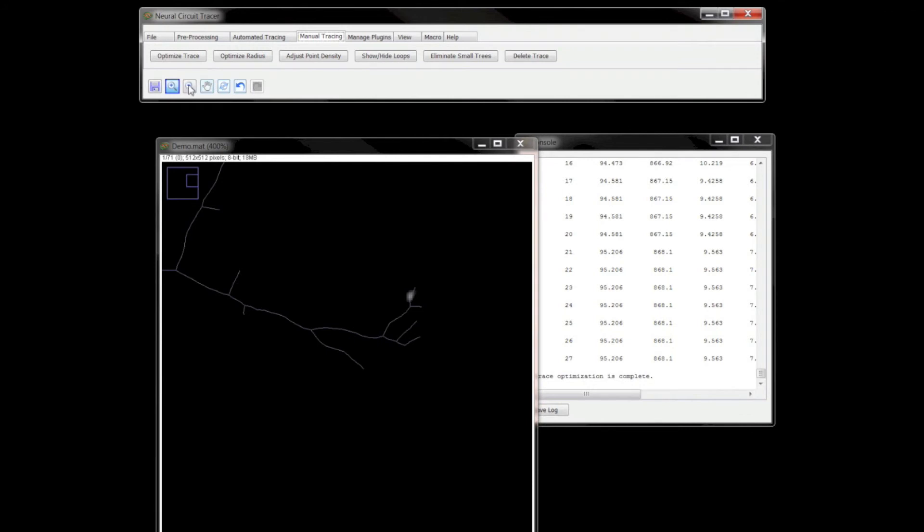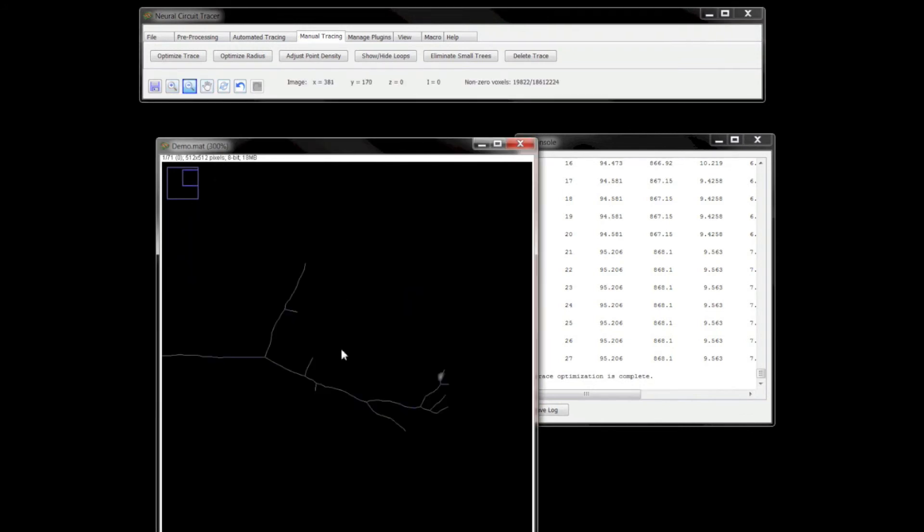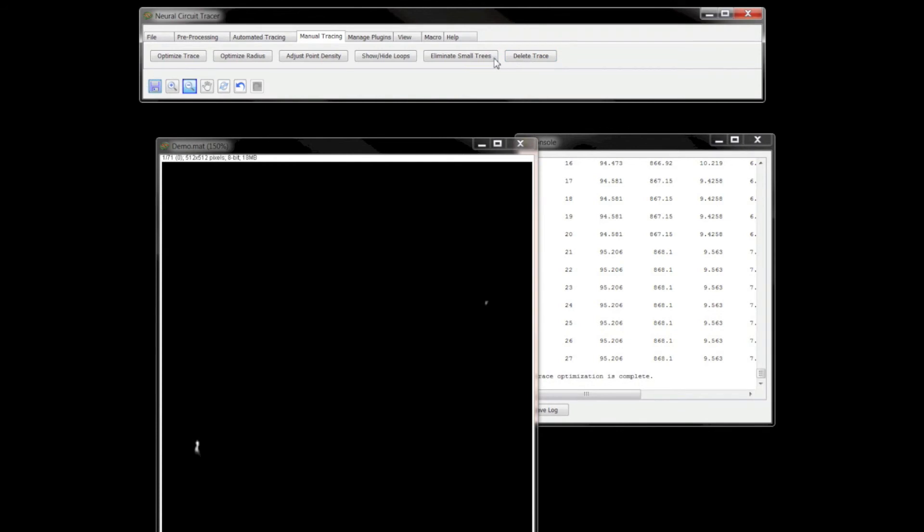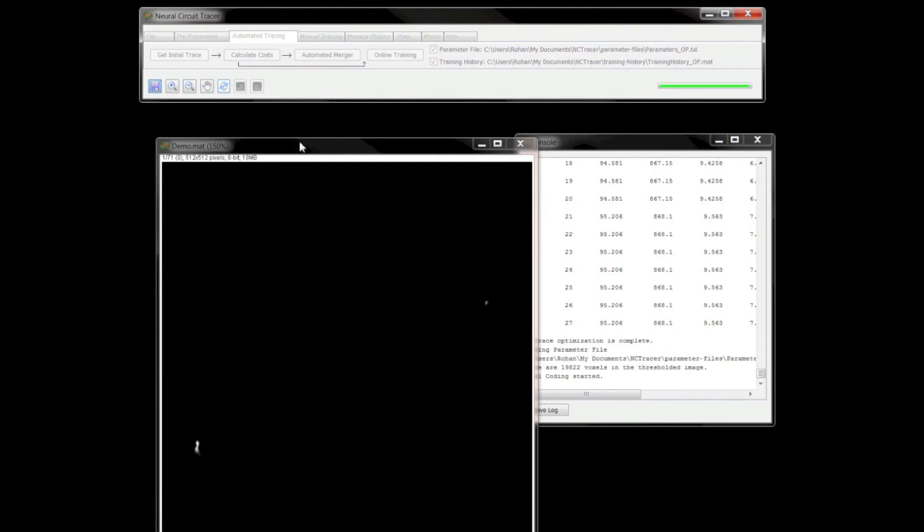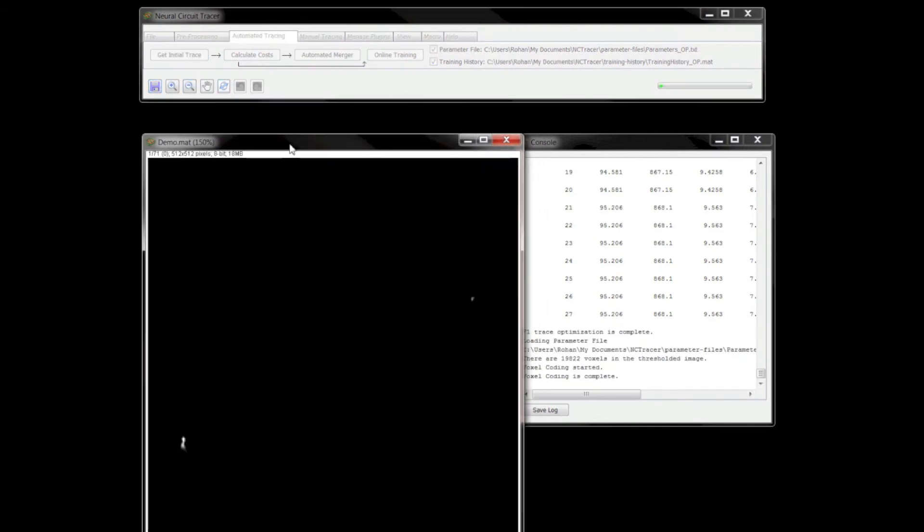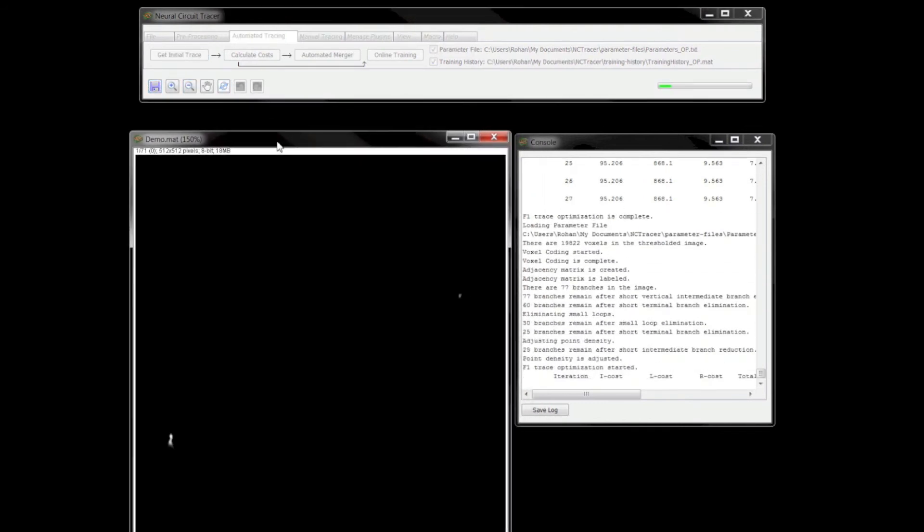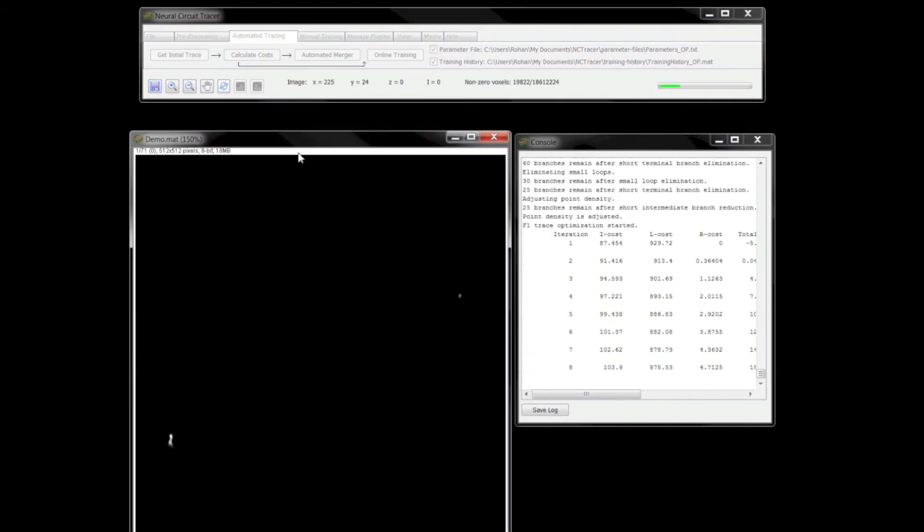Let me delete this trace and generate one automatically using the Get Initial Trace button under the Automated Tracing tab. This operation requires that the image has been preprocessed appropriately, which it has already been in this case.